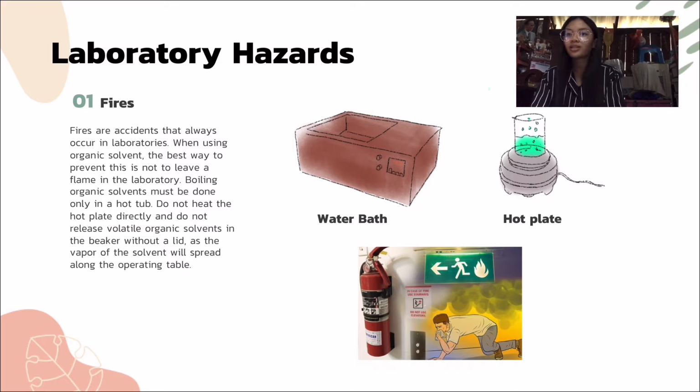Do not heat on the hot plate directly, and do not leave volatile organic solvents in a beaker without a lid, as the vapor of the solvent will spread along the operating table.